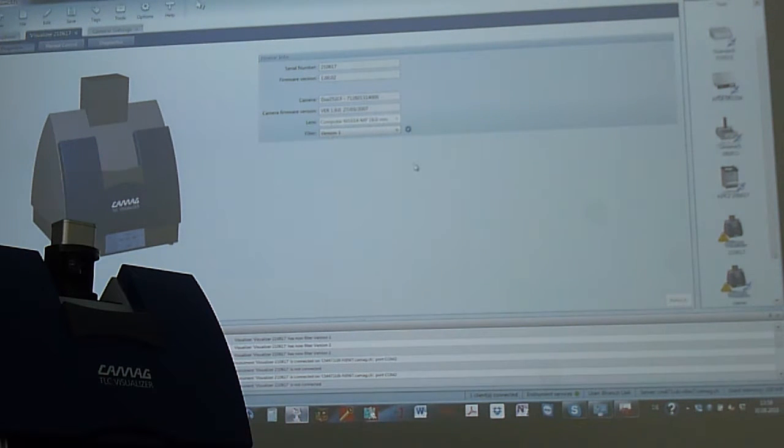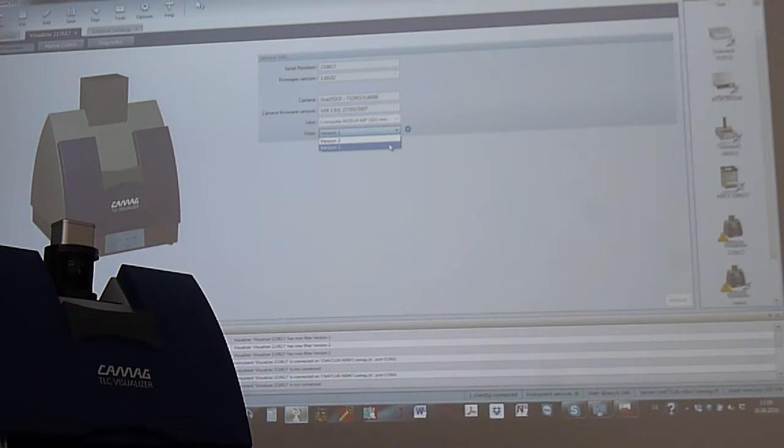The thing is that in Visualizer 2 it is a difference. But with Visualizer 1 now, it has no difference. So therefore, it doesn't make a lot of sense right now. As soon as you have the Visualizer 2, it makes sense. But I have to talk anyway about version 1 and 2. If there is no difference between version 1 and 2, and the difference is only the thickness of the ring, maybe we can leave that away.